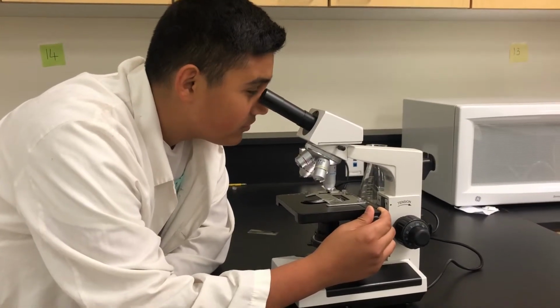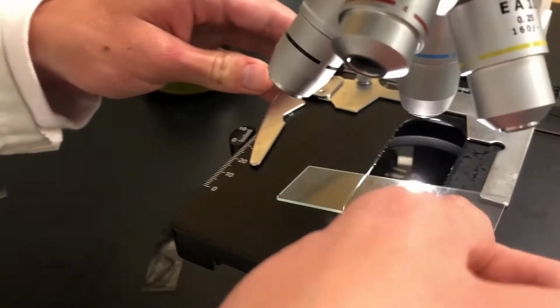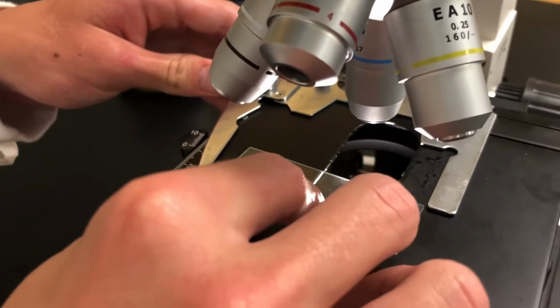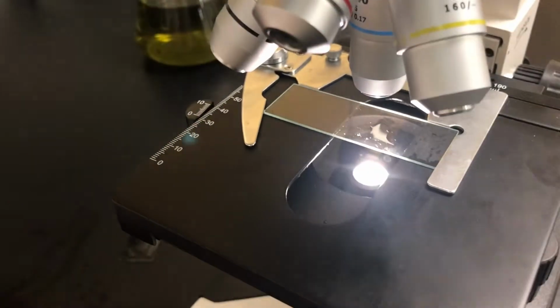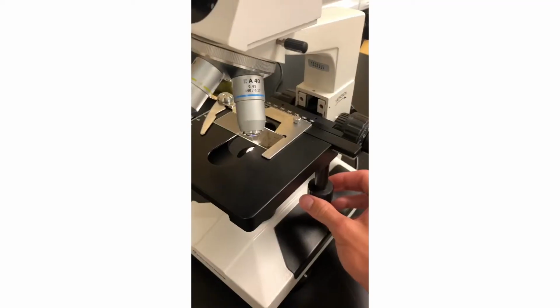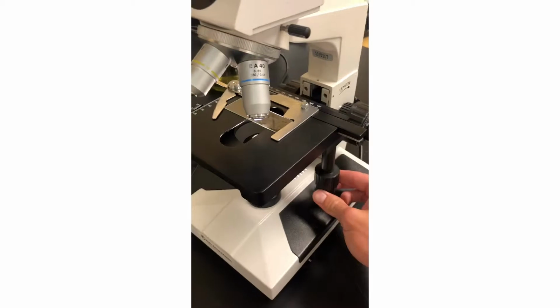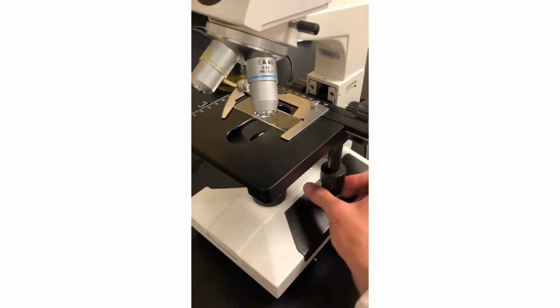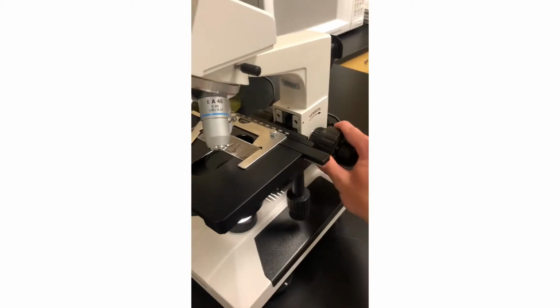Measurements to what you need. When handling the slides, be extremely careful as it is real glass and very delicate. Place it and then add tension. Good, stop. To move the slide back and forth, use the top one right here. To move it left and right, use the bottom one right here. To add tension, go up or down.